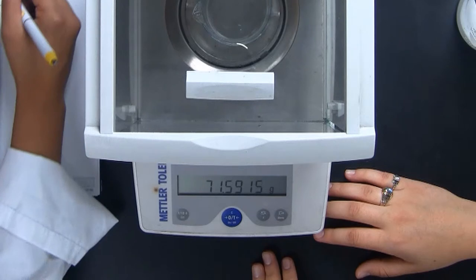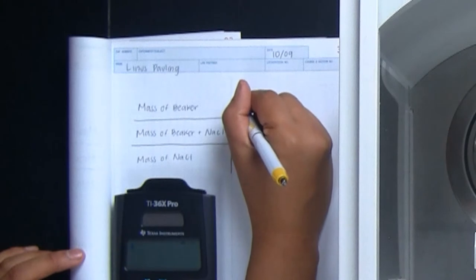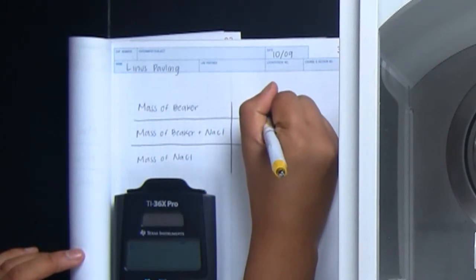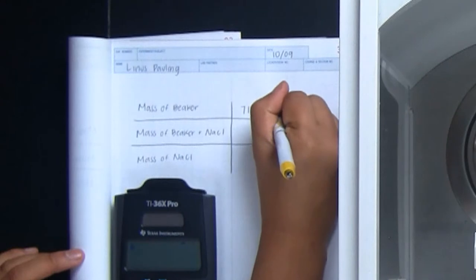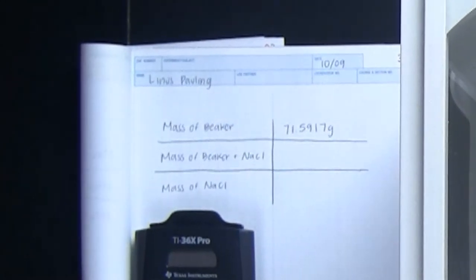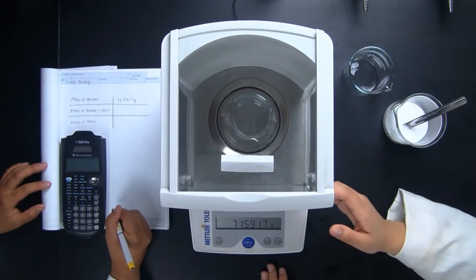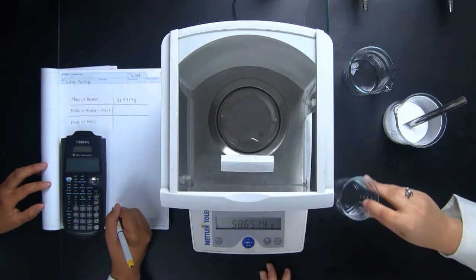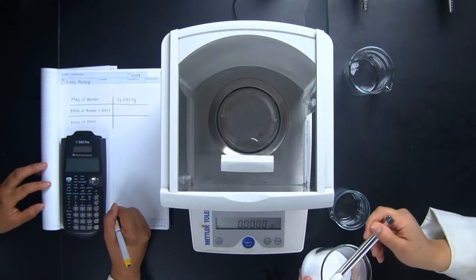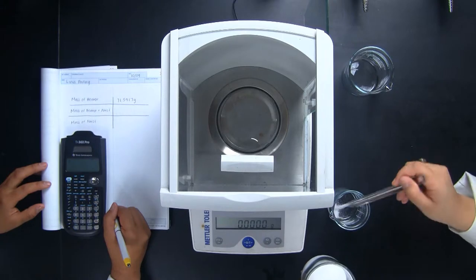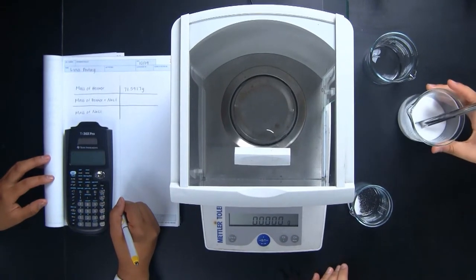Wendy has set up the data table to account for the mass of the empty beaker. Ileana carefully opens the balance box, places the beaker inside, and then closes it. This keeps any air movement through the lab from altering the measurement of the balance.